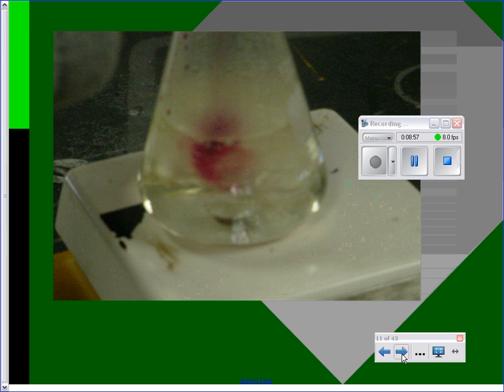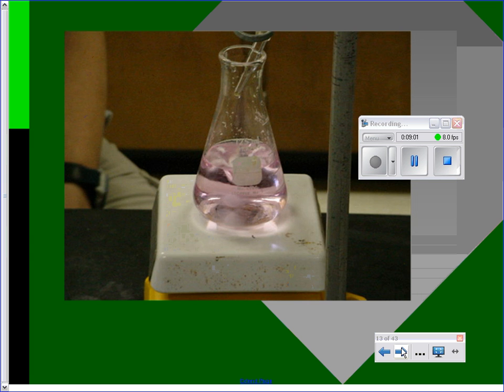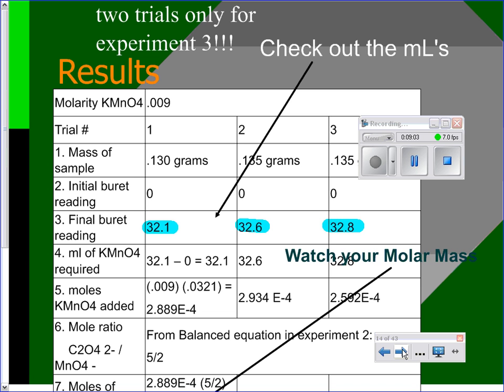So we're going to continue the titration, same exact heating, same exact look and endpoint, equivalence point, and here I want you to check out the mils are a little more this time. So I'd say go fast to about 25 mils. You should be hitting in the low 30s, so it's safe to go fast, 25.